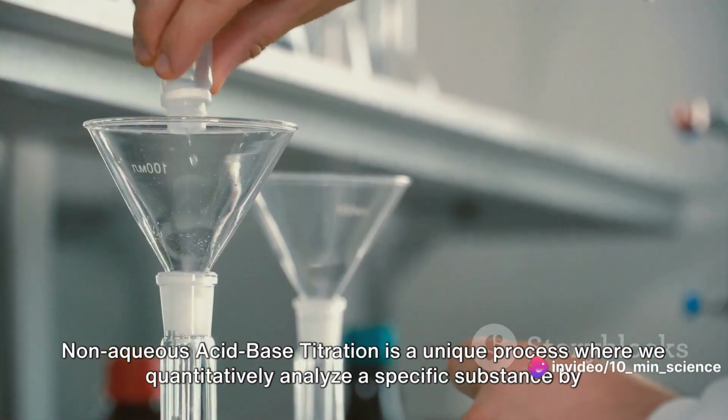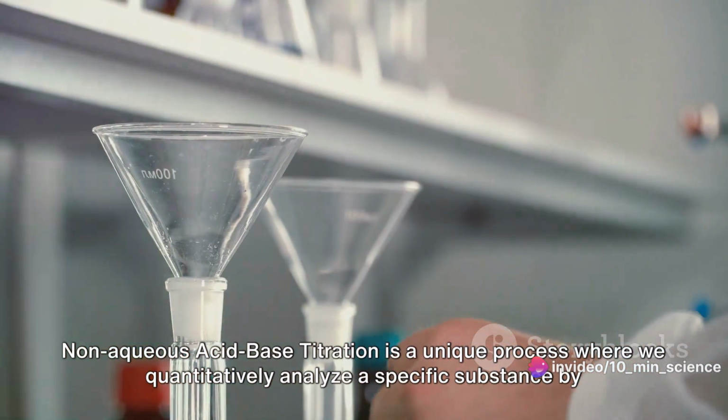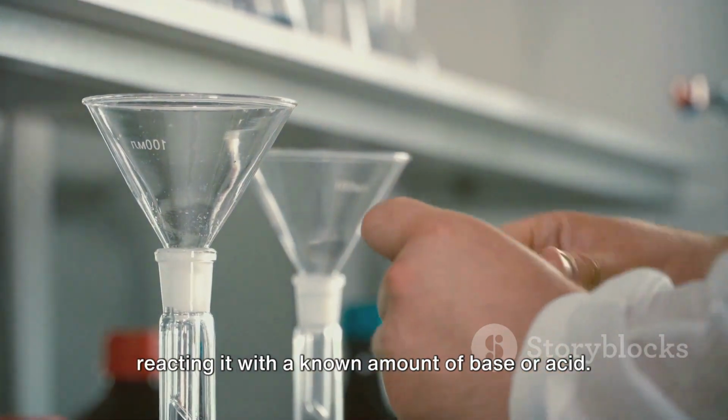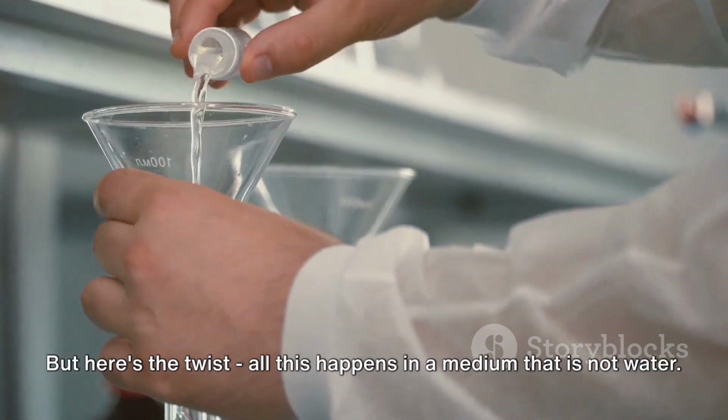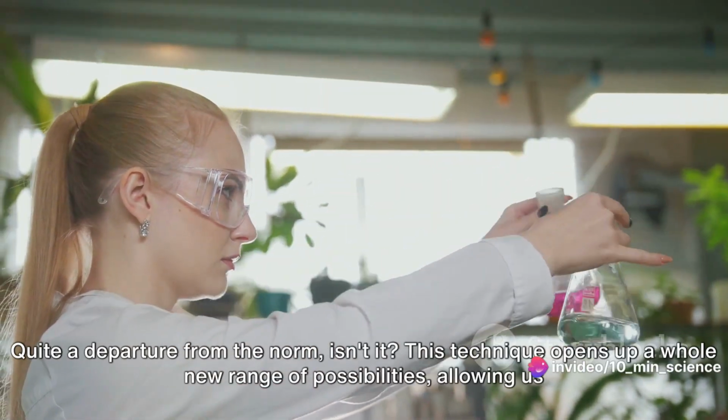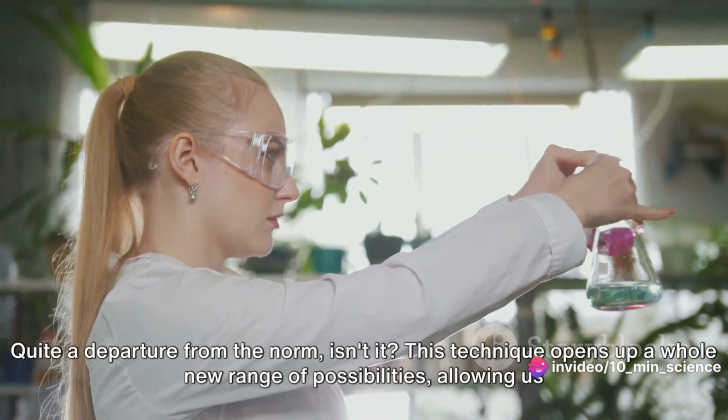Non-aqueous acid-base titration is a unique process where we quantitatively analyze a specific substance by reacting it with a known amount of base or acid. But here's the twist. All this happens in a medium that is not water. Quite a departure from the norm, isn't it?